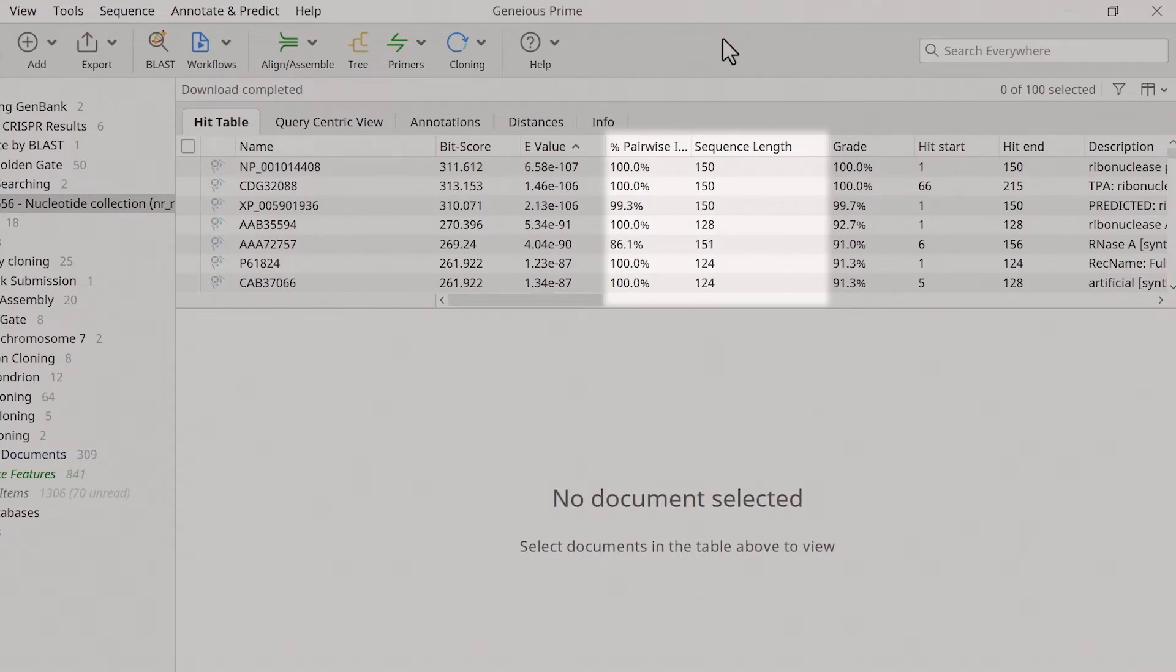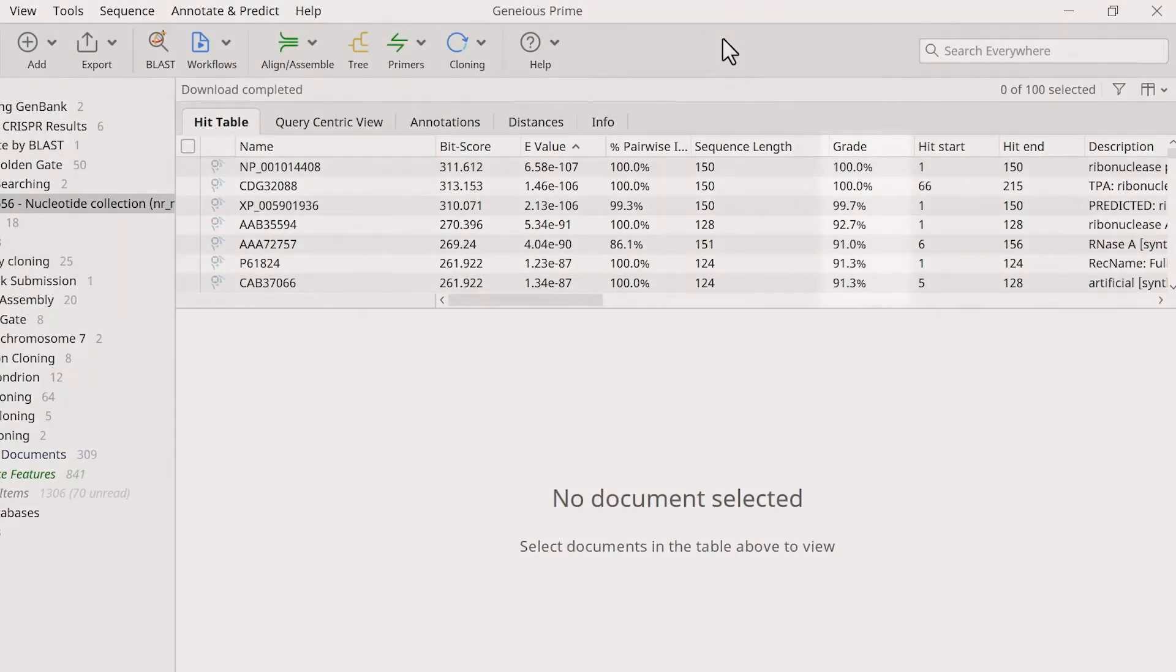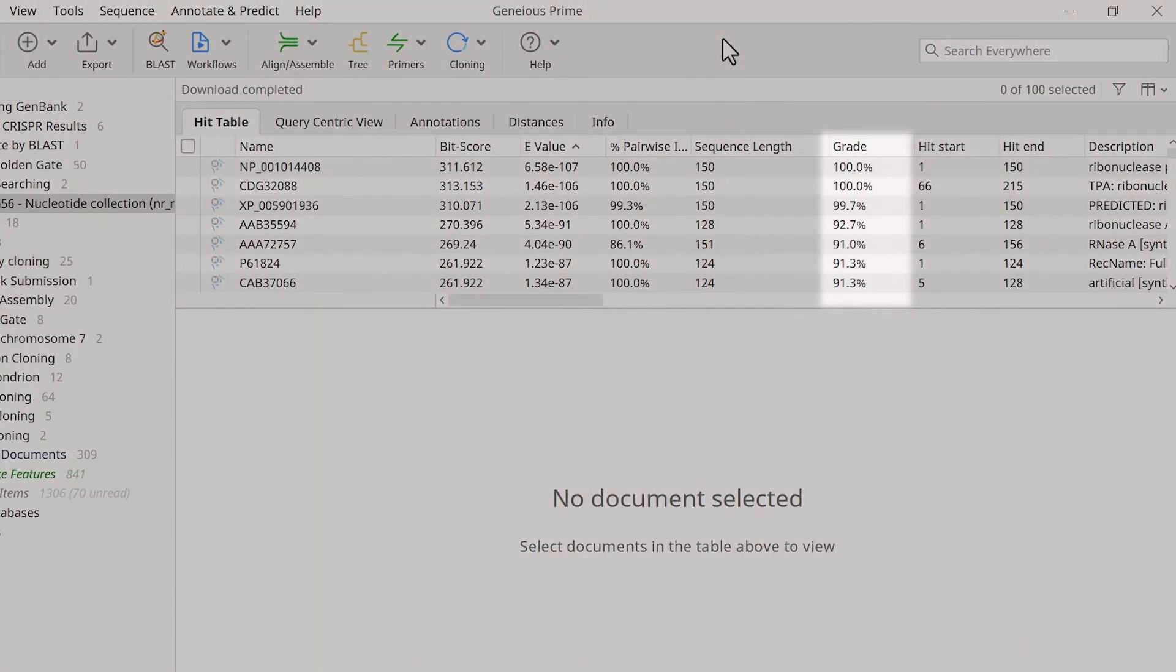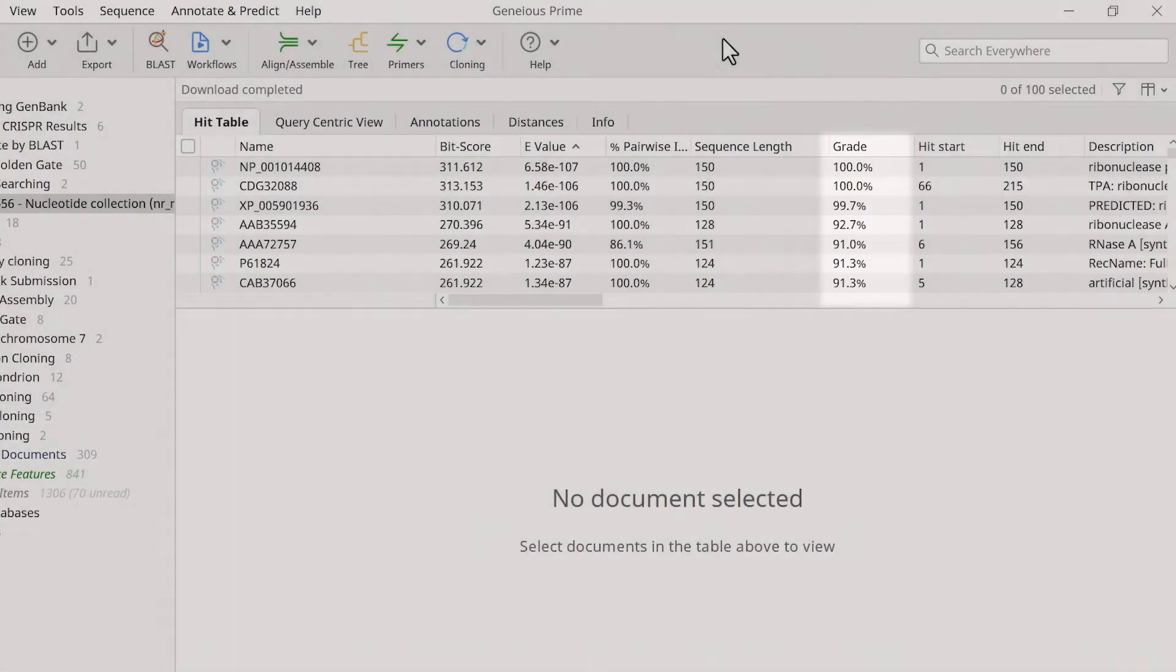By combining the e-value, percentage pairwise identity, and sequence length values, Genius also calculates a grade score. This weighted value determines the longest hits with the highest matching aligned region to the query.